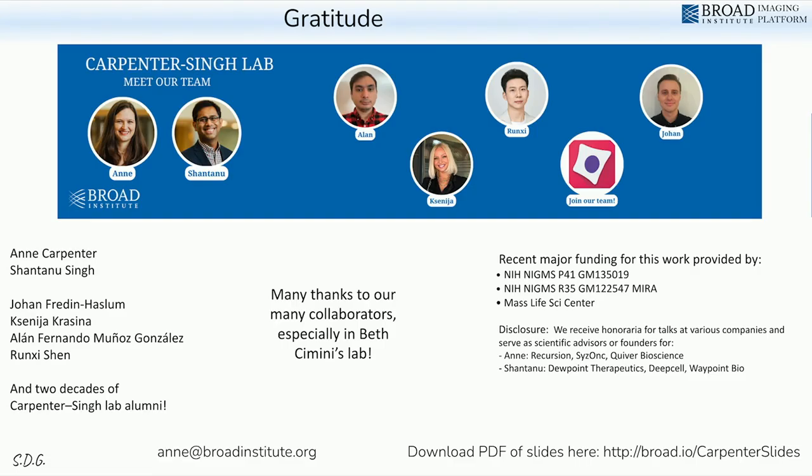So there are deep learning based methodologies that show you what the model is paying attention to, and that can be helpful, but they're not so amazingly successful that we do this for every project. Most of the time we try to live without the interpretation. We try to rule out technical artifacts and then just move on with our lives. But if it's not one of the simpler ends of the spectrum, there are methodologies, though they are a little painful, to try to get at this interpretation question.